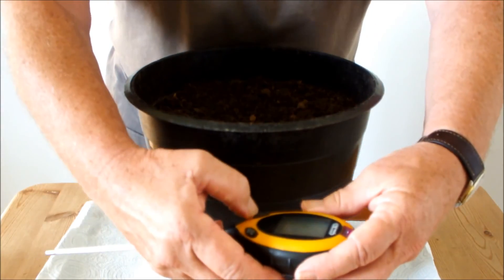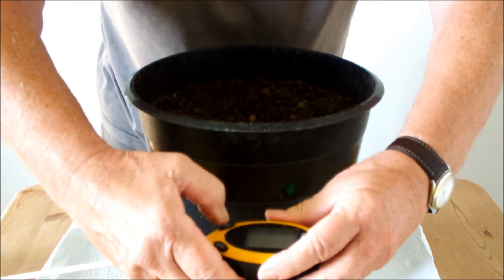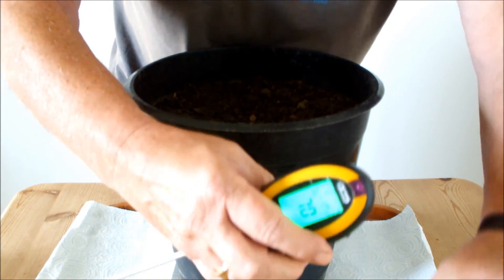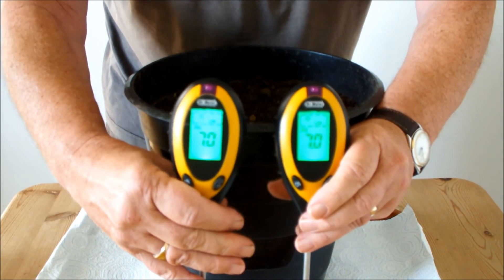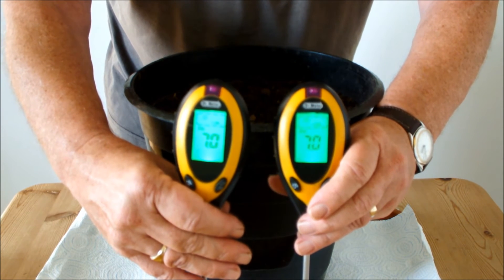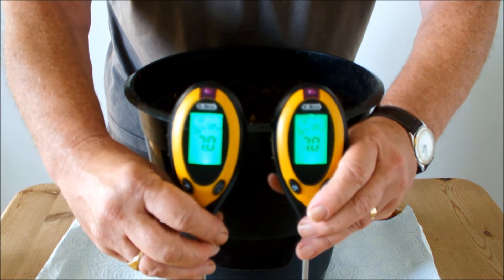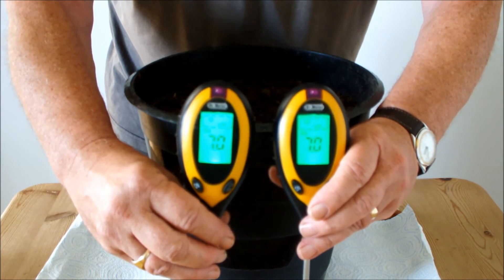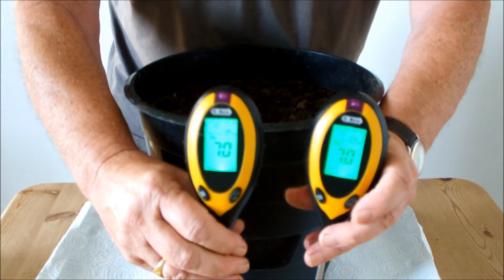So I'll switch these on. That one's on and that one's on. The reason I'm using two is that if these meters work, you should get a very similar reading on both of them because they're going roughly into the same location in this compost — only inches apart. Let me pop them in and see what we get. They're both recording a pH of seven now.